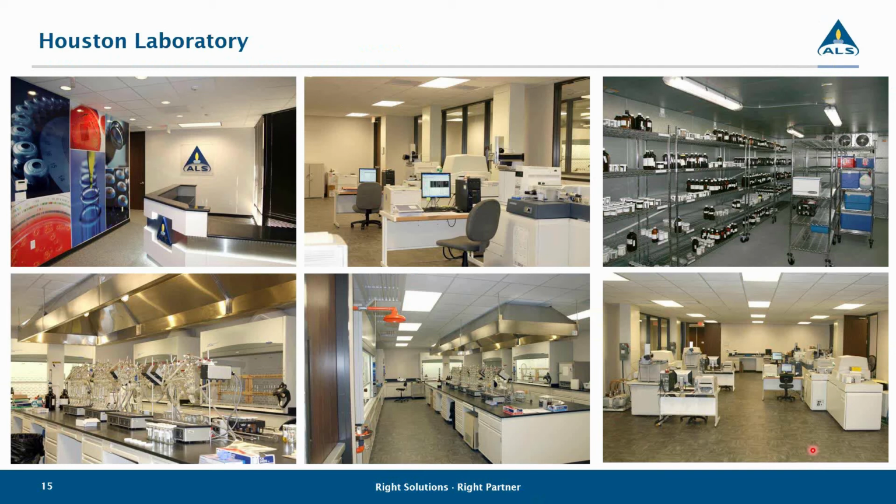So we usually re-extract, and we try to have our labeled standards within the required limits. But if it's not possible to re-extract, we do report those values qualified with low labeled standards. But as long as all the other identification criteria are met and you have good detection limits, we see that data is very accurate, and that's just based on experience. I can get you a more technical answer from our technical director if you need me to.